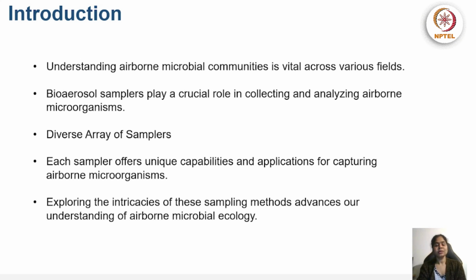So when it comes to understanding the microbial communities in the air, bioaerosol samplers play a vital role because they help us collect the sample and understand the diversity and richness in a particular area. Because of this developing interest in bioaerosols, there is a diverse array of samplers in the market. Each sampler offers unique capabilities, and their application for capturing airborne microorganisms could vary.